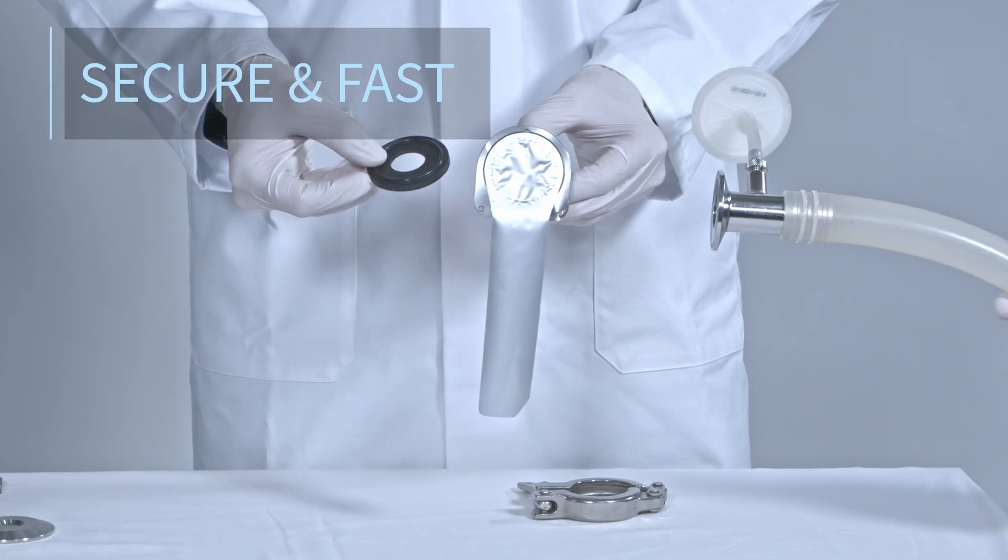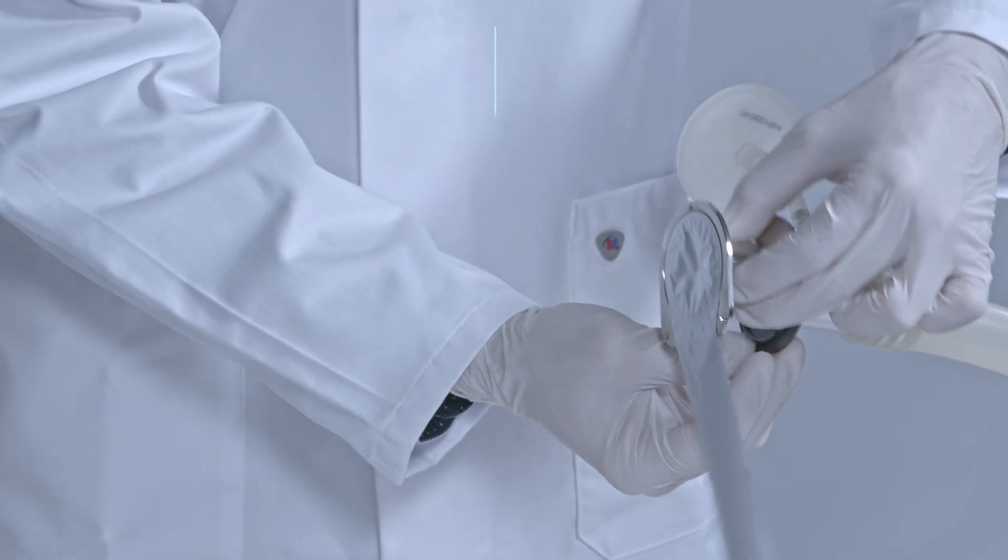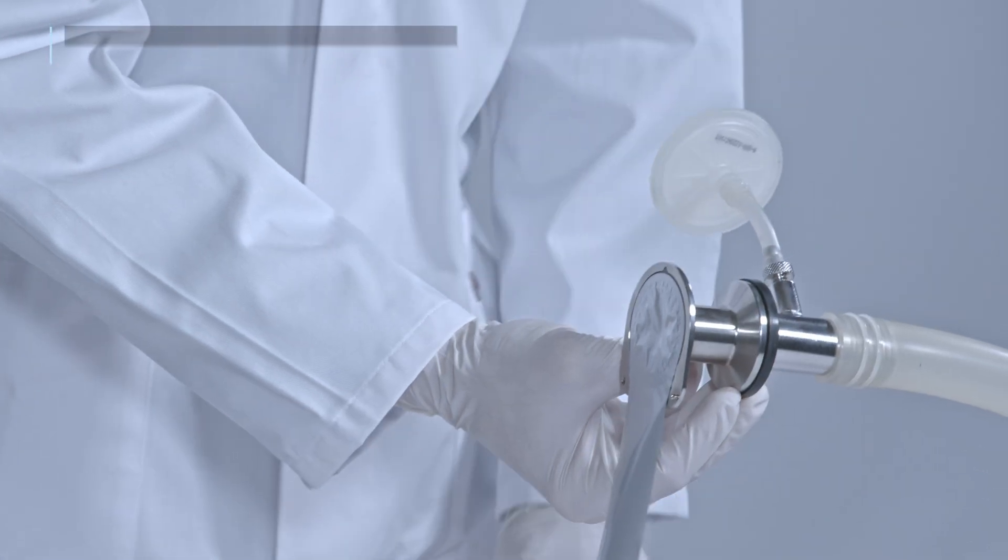It offers easy handling, resistance to reactive substances, mechanical and temperature stability.